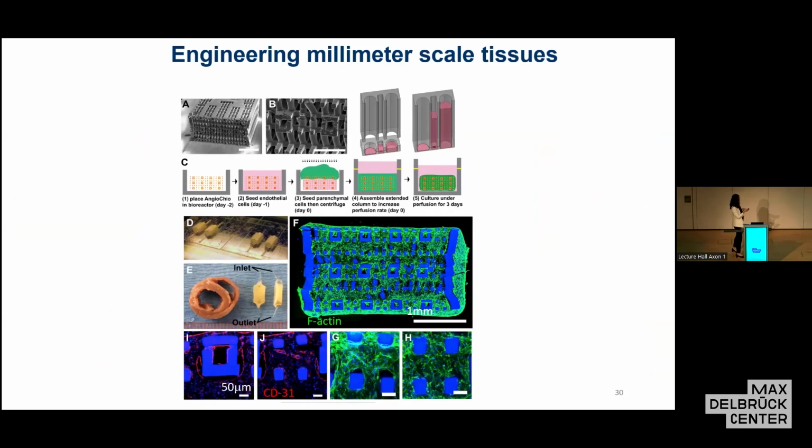And then you have to grow them with higher pressure head. So he modified his bioreactor to provide enough flow. And then we were able to get a tissue that was quite thick, as thick as the left ventricular wall of the adult rat heart, and that it had cells uniform throughout the entire tissue.